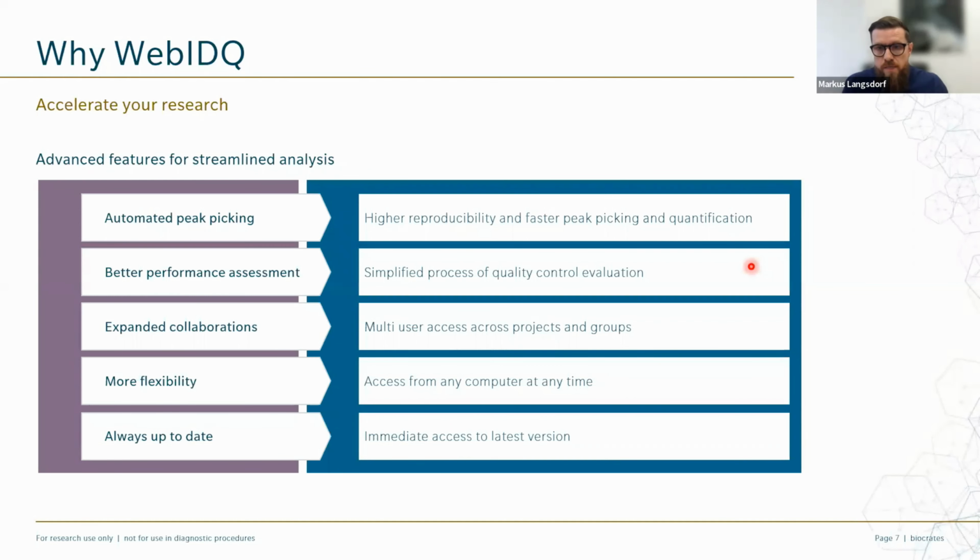Another new feature is in the validation part. Besides the accuracy check, also the CVs are calculated across the QC replicates over the plate, giving you higher confidence about the performance of the measurement and finally the analytical quality of your data.